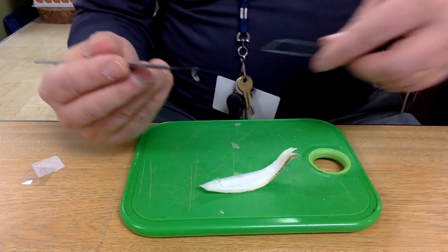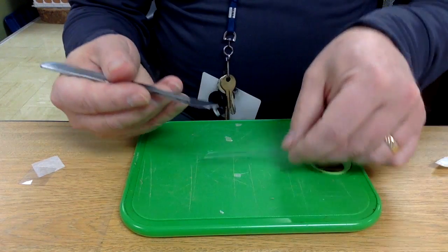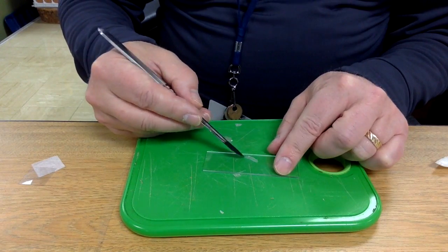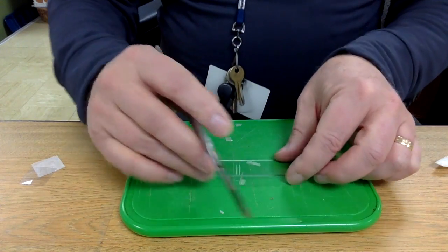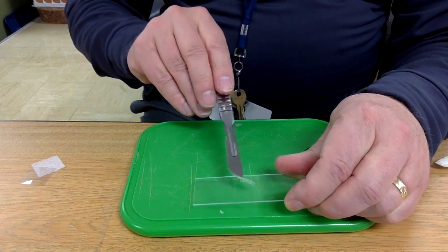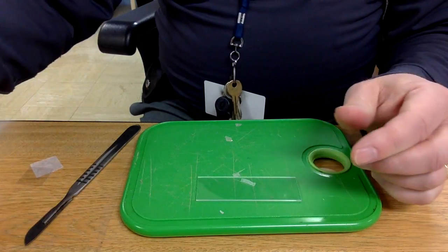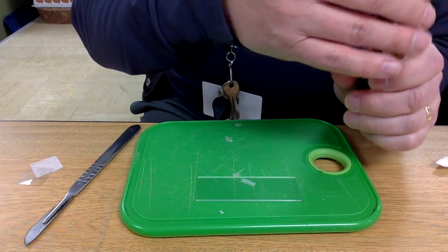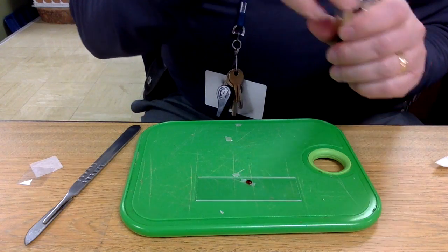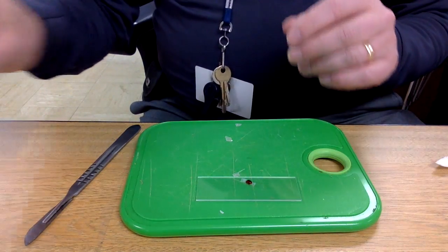Now it's time for the slide. Just place that small piece of onion there. You may use a finger to keep it straight — it doesn't need to be exactly in the center as long as it's on there and not folded in on itself. It's not a fatal flaw if it folds over a little bit. One drop of iodine right on top and a cover slip, and you're ready to go.